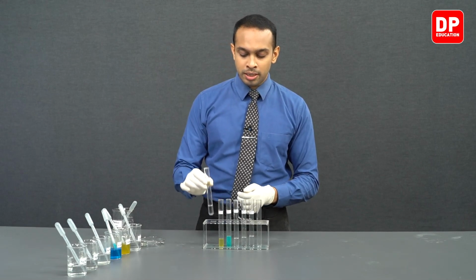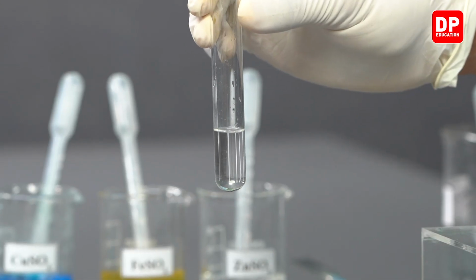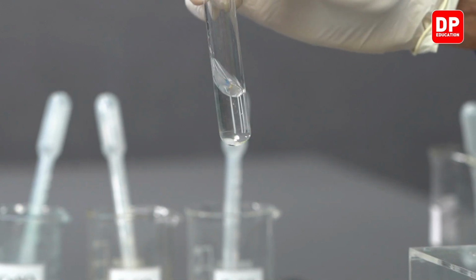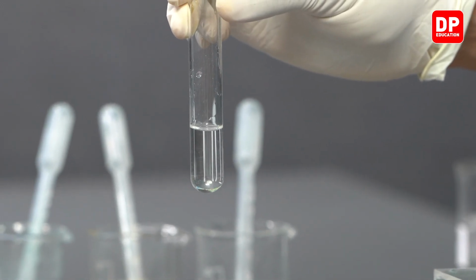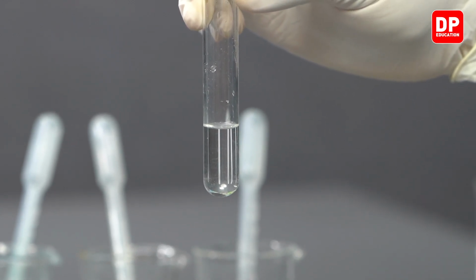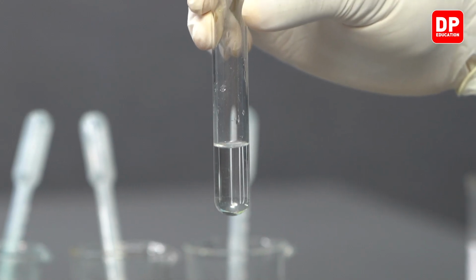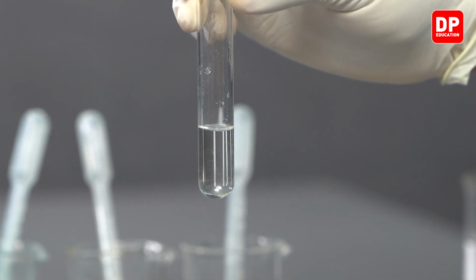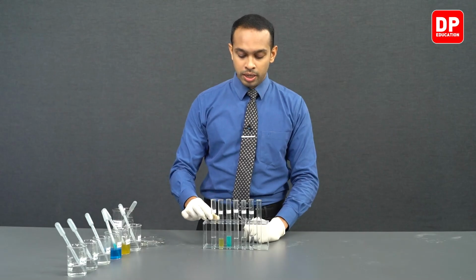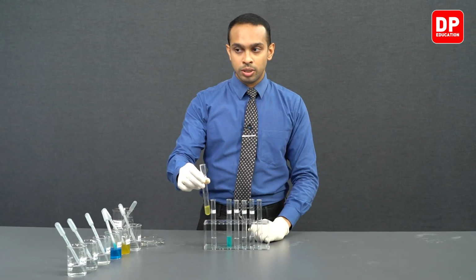If you take a look at when lead was added to zinc 2 plus, we don't observe any color change and we don't observe a precipitate formed as well. So this indicates that zinc 2 plus ions were not displaced by lead metal. We can say the same about the Fe2 plus ion solution as well.